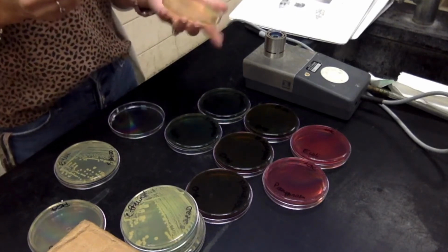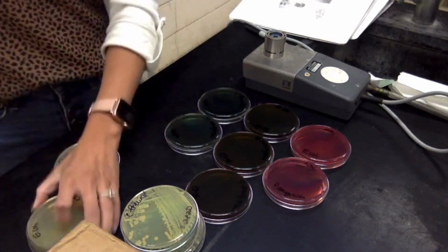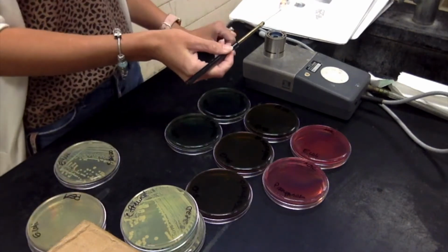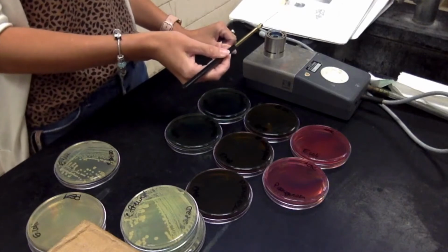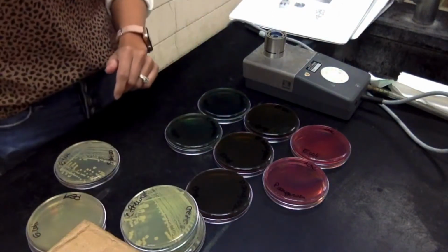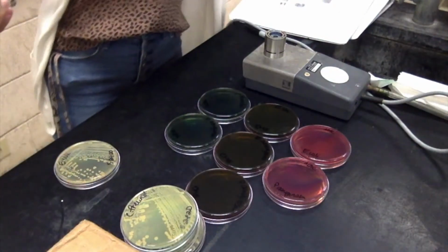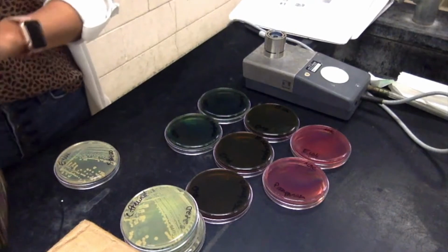And if you notice, I don't reflame my loop between 2 and 3 because I simply flip my loop over. If you flip the loop over, then you're using a new fresh side that doesn't have any bacteria on it. Alright, so my 2 PEA plates are done, so I'm going to add those to my box.